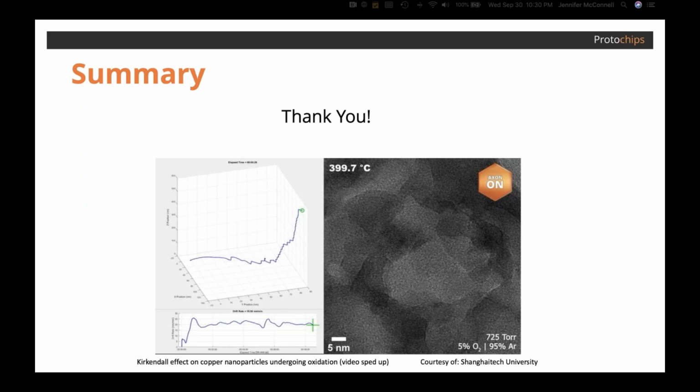Yeah, that's another great question. It's one that's pretty important to the message of this webisode. In the TEM lab, basically, there's either one or two main computers. One of them is managing the microscope itself, and you may have a second one managing the imaging system or camera. AXON connects within the lab through an intranet to each of those computers. That's how it's getting the images that it needs to do any of the real-time corrections for drift and focus, and then controlling the microscope to make adjustments with the goniometer to keep everything stable and in the center of view. Now that's all done in an intranet.